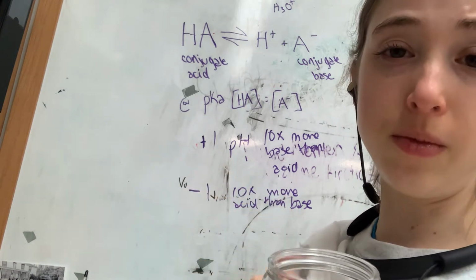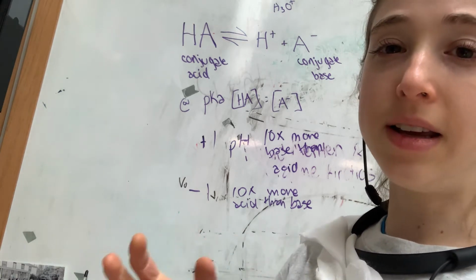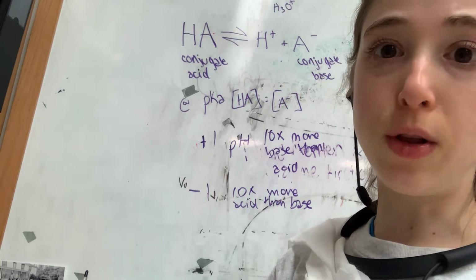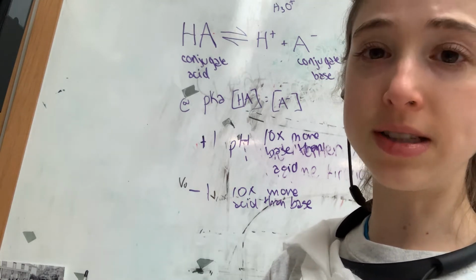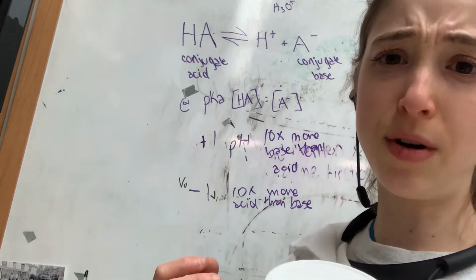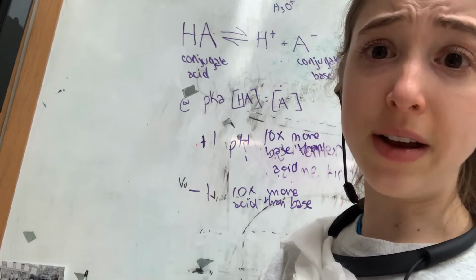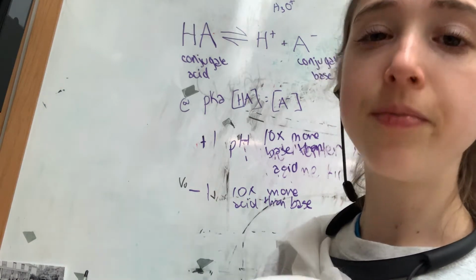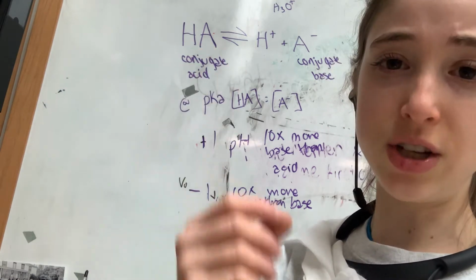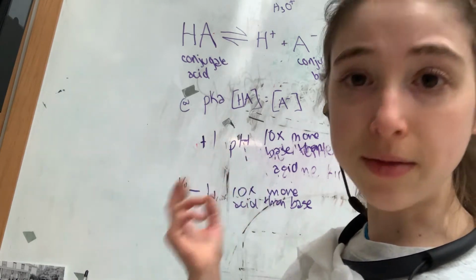And so for the strong acids, if we have a buffer that we want to use, when we're adding an acid or a base, such as HCl, hydrochloric acid, or sodium hydroxide, NaOH, you can see that those have a carrier ion. Basically the H+ part of the HCl is what we care about. We want the proton. The OH- part of NaOH is what we care about. We want that hydroxide ion. But we need that counter ion to make this neutral salt or solution that we can add. And so we want to make sure that that counter ion is something that's already going to be in the buffer that we're going to use.